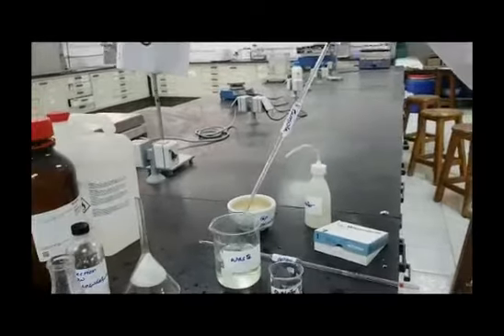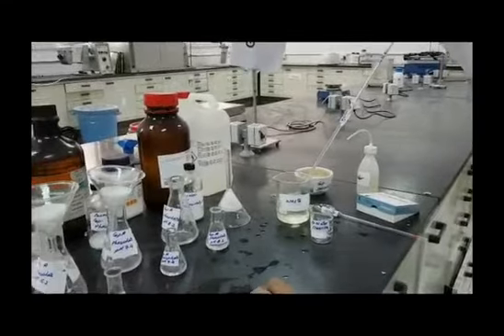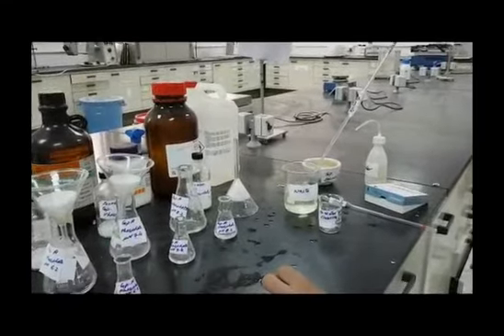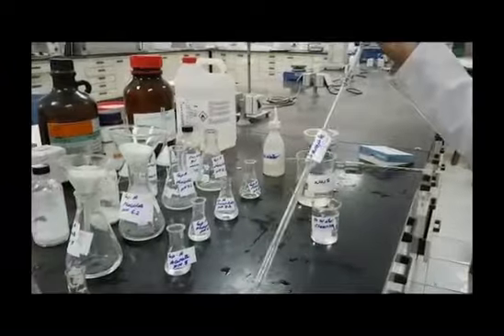Always remember to rinse the volumetric pipette thoroughly using distilled water in between samples, before and after withdrawing the filtrate.